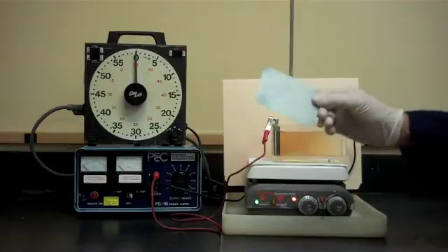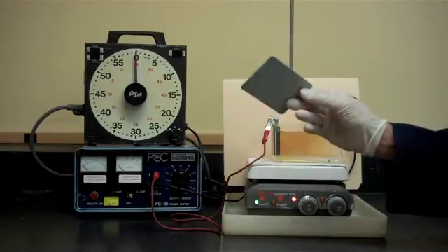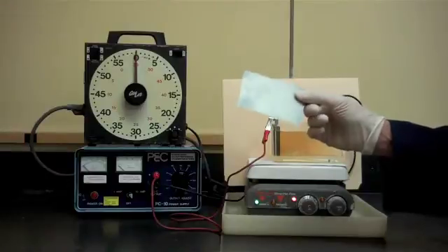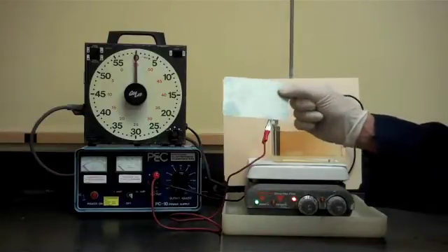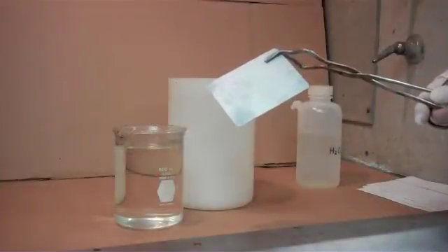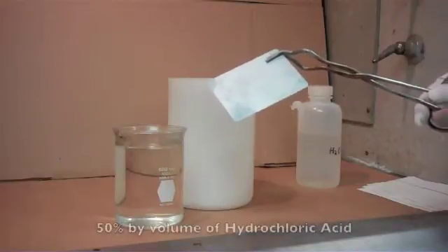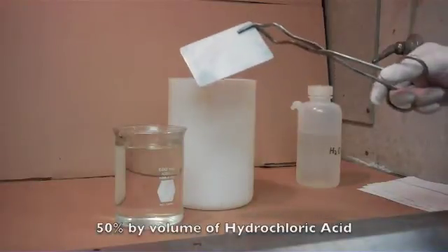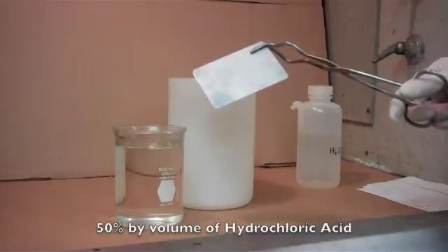In order to do this test we first have to remove the zinc coating that is present on the Hull Cell test panel, and we will do that by removing it in some dilute acid. Here is the Hull Cell test panel. We are going to immerse it in a 50% by volume solution of hydrochloric acid.